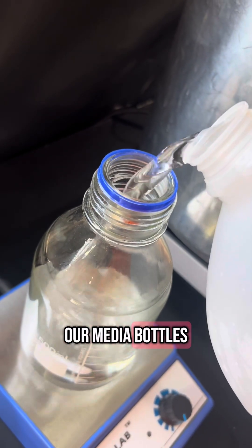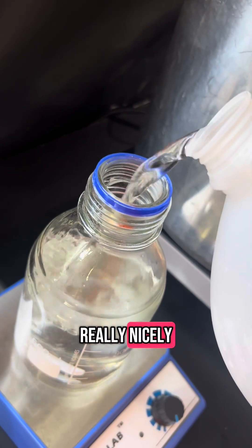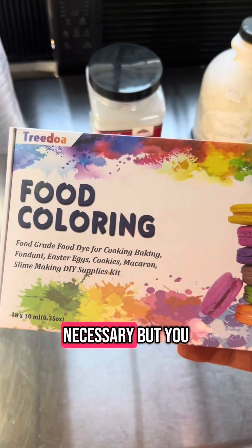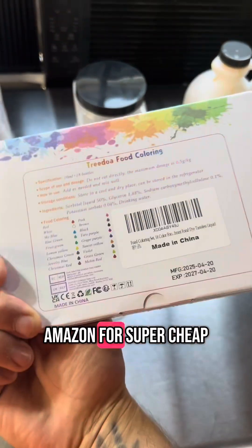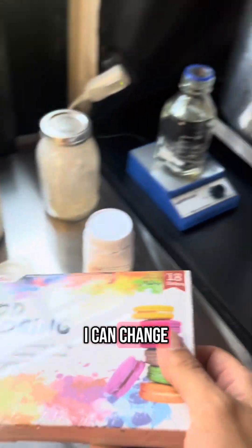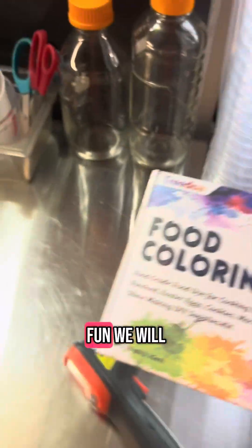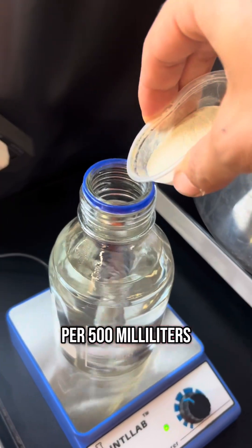Go ahead and pour warm water into our media bottles. I like warm water because it mixes everything really nicely. This isn't necessary, but you can get some food-grade food coloring — I just got a huge pack on Amazon for super cheap. I kind of like changing up the colors, it makes it fun. We will use 10 grams of agar powder per 500 milliliters of water.